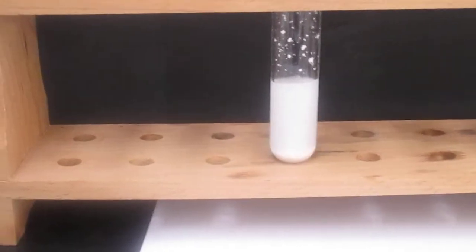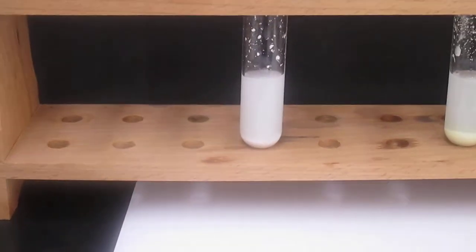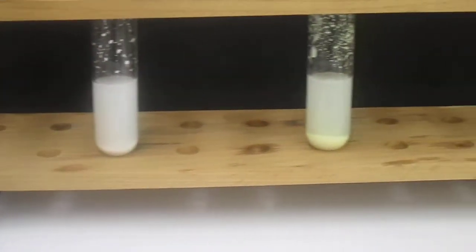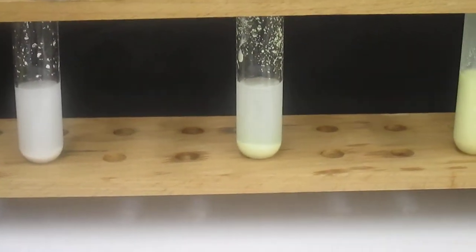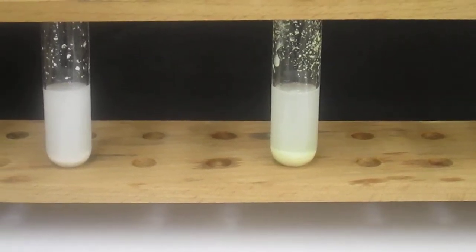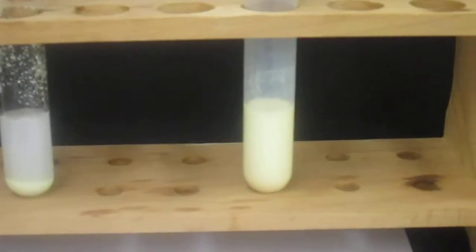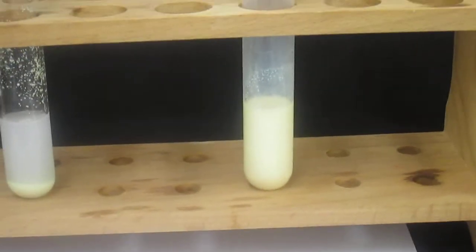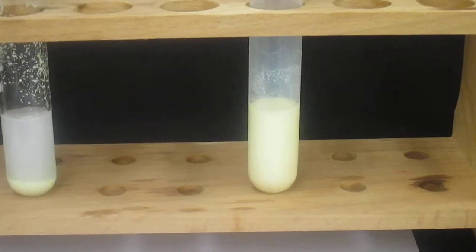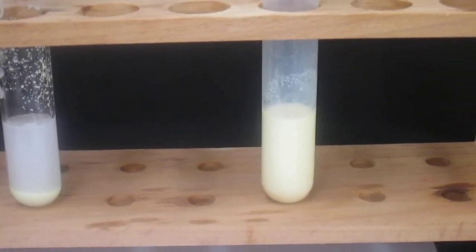Another thing that I would like for you to notice as we look at each of these: this is the sodium chloride. Notice the amount of layer that it has at the bottom, as compared to this, the sodium bromide. We see a little bit more of our solid, our precipitate. And then lastly, this is our sodium iodide. Notice that there's almost no settling, so it's fairly loaded with precipitate. It's just not settling out to the bottom.